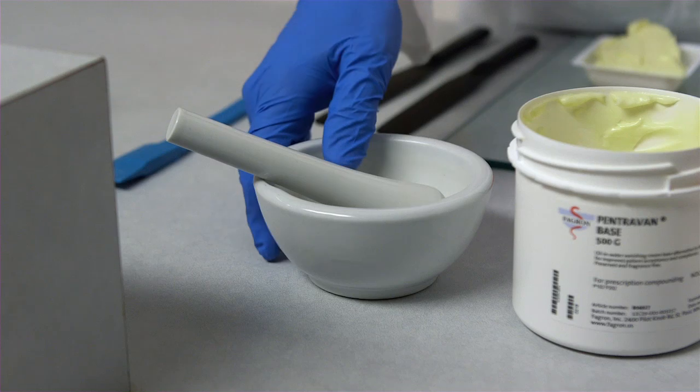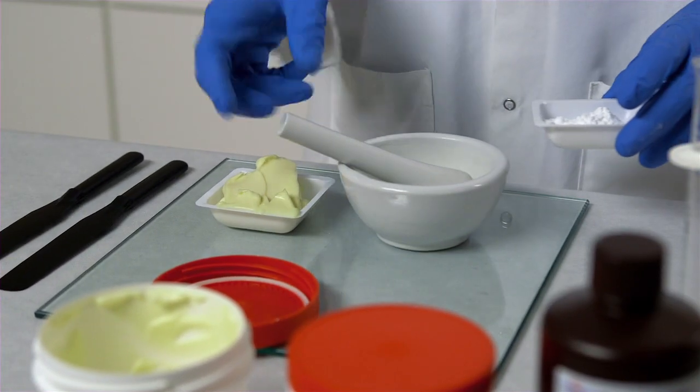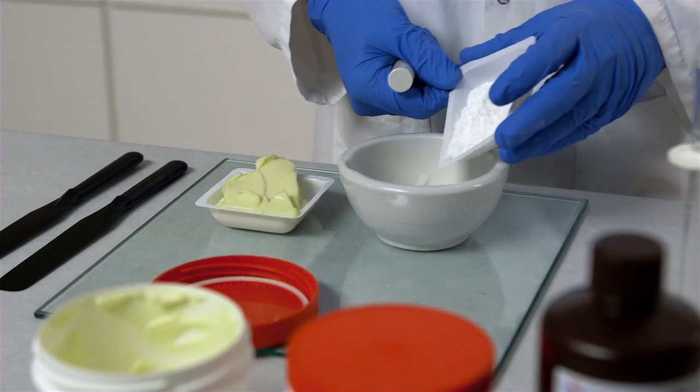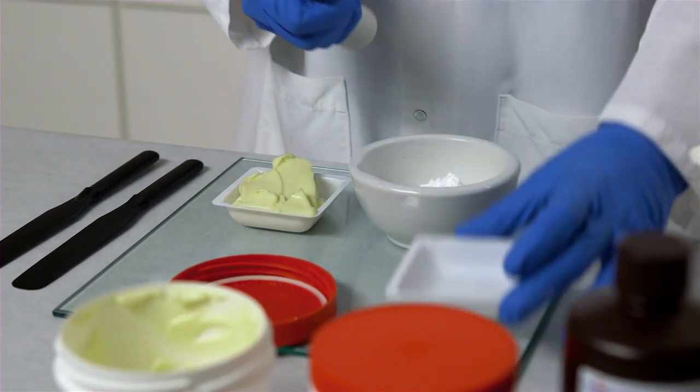The first step is reducing the particle size of the Ketoprofen in the ceramic mortar and pestle. The first thing we'll do is add our Ketoprofen into the mortar and reduce the particle size.